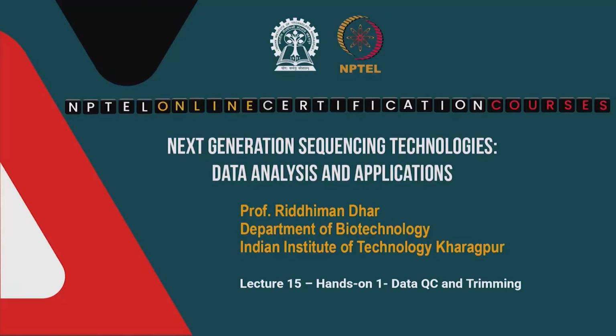Good day everyone, welcome to the course on next generation sequencing technologies, data analysis and applications. In the last class we looked at a FASTQ data file. We explored this with the VI editor, and then we set up the FastQC tool and at least ran the FastQC tool.